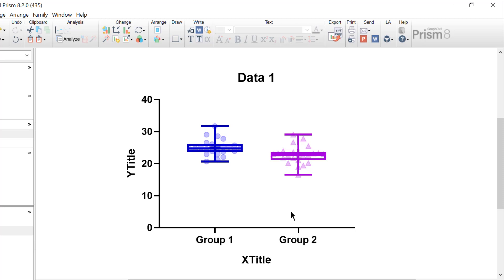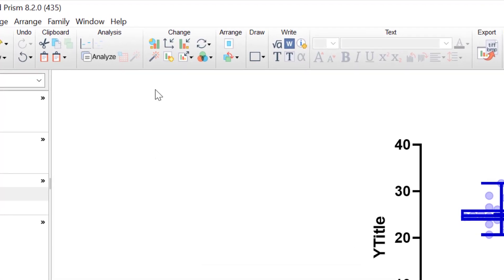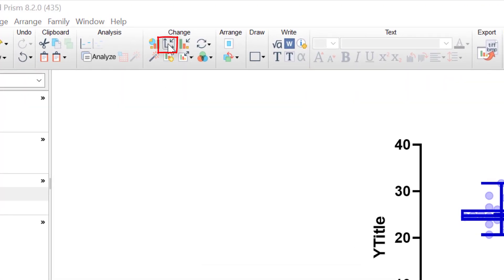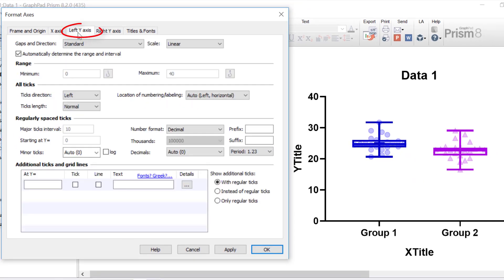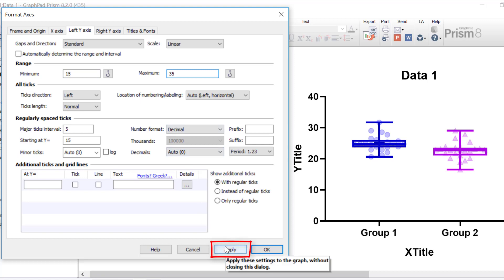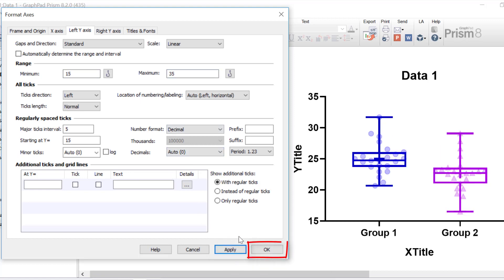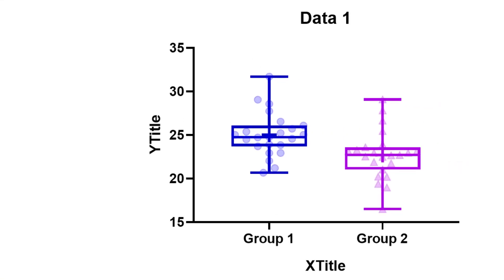Another thing that I'd like to do on this graph is remove the white space underneath the box and whisker plot. And this will also zoom in on the plots themselves so you can see the plots a lot better. So to change the axes, you want to click on the format axes button at the top. I'm going to go to the left y-axis tab, and then currently the range and interval is automatically determined by GraphPad. However, I'm going to untick this option and change the minimum value to be 15 and the maximum value to be 35. And I'm going to click the apply button. And then I'm going to click the OK button to return to the graph.